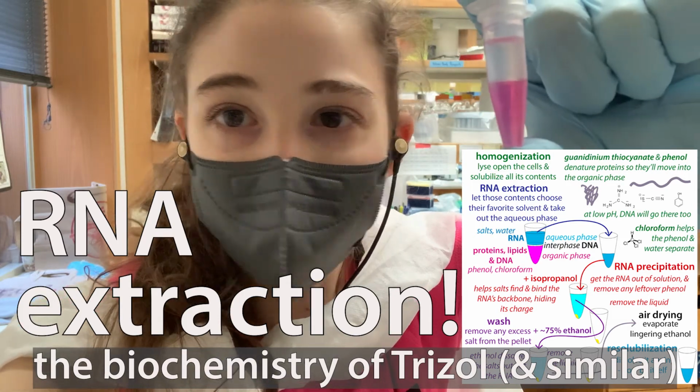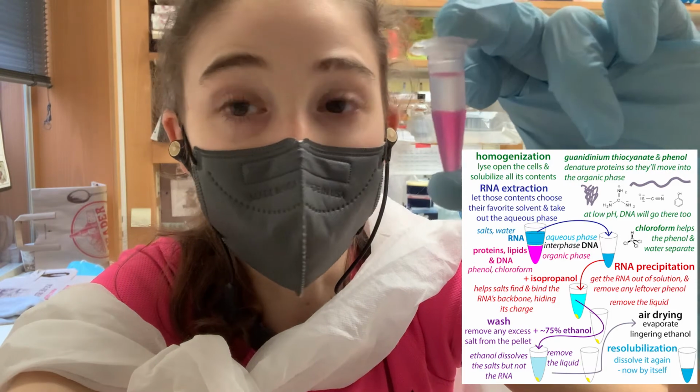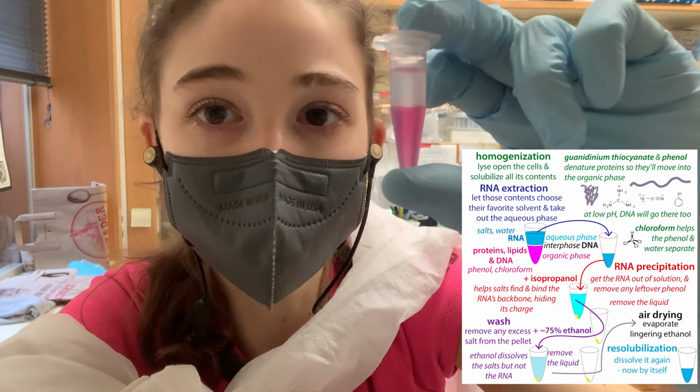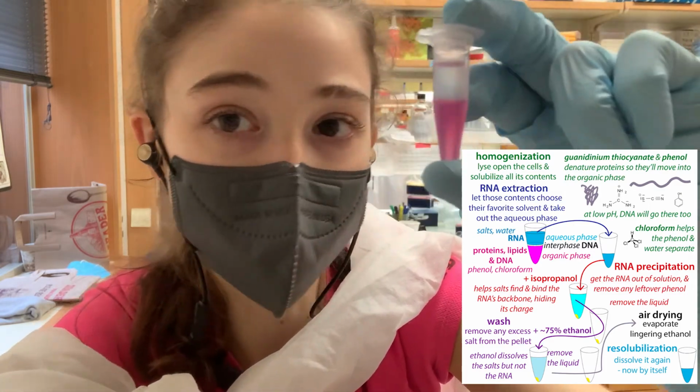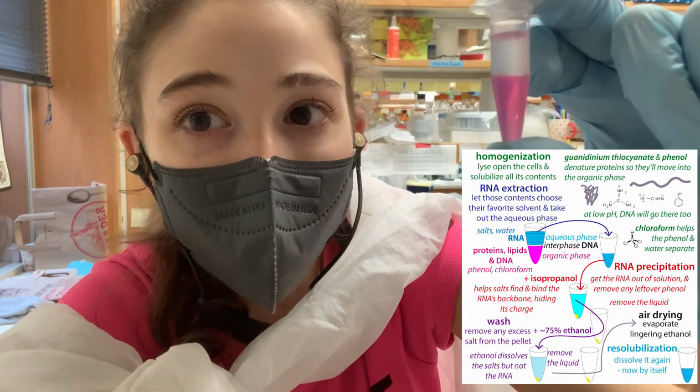The biochemistry behind the action of an RNA extraction. It's a bit like a biochemical magic trick, where we take a series of steps, and we give molecules a choice of which liquid they want to hang out with. And at the end of the day, we've got pure RNA.